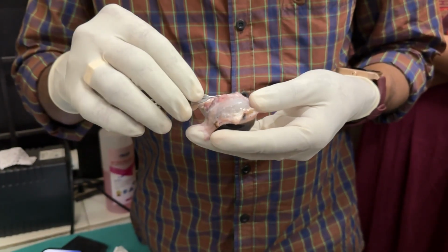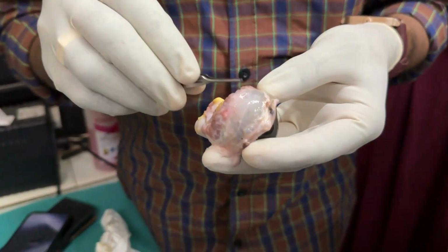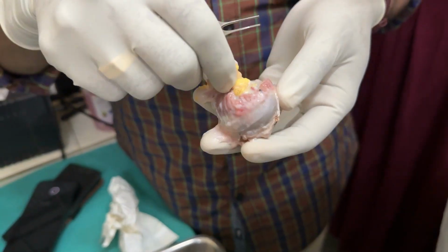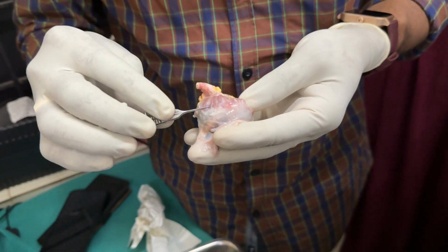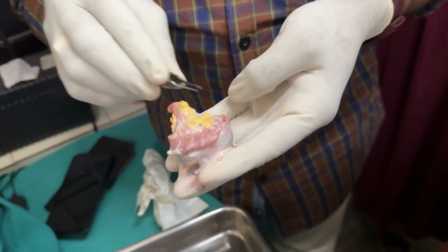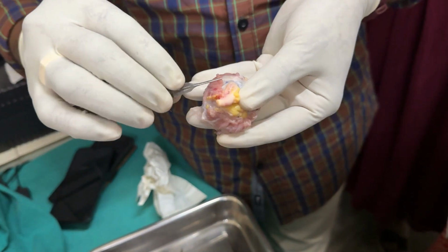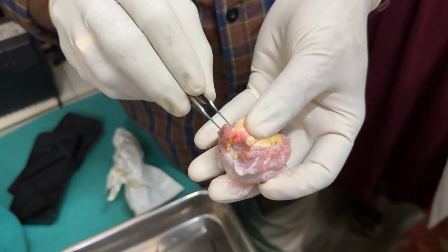Superior rectus muscle. Actually, there is a gap, only a small gap between the rectus muscles. Altogether, when we are seeing from outside, it will be a continuous ring. But actually, there is a gap between the superior and medial rectus, a gap between the lateral rectus, and a gap between the inferior rectus. We can dissect like this, and we can take it out.